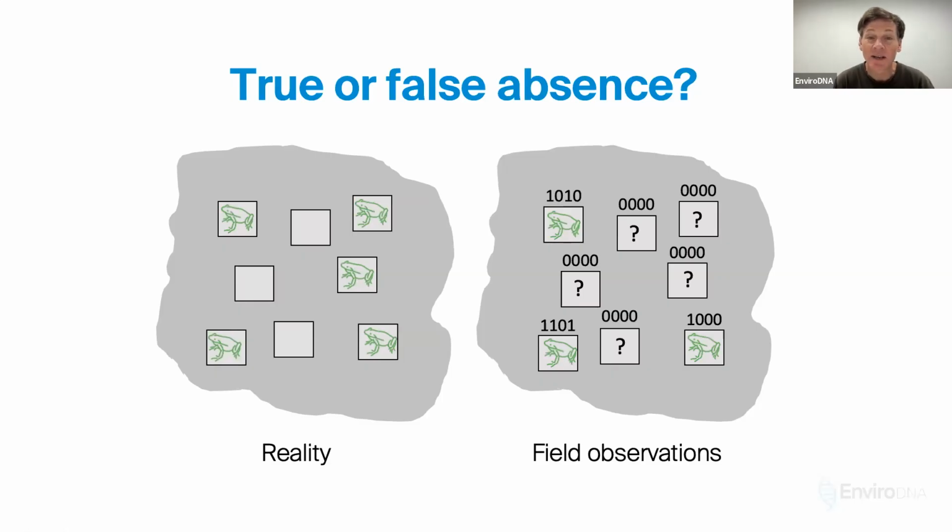You can have false negatives, you can have false positives, of course. No laboratory or field protocol is completely bulletproof. We implement a ton of controls of different types in the lab and molecular tricks to make sure that false positives are minimized, or we can at least detect them, but no one would ever claim to be perfect. What do you do with these negatives?